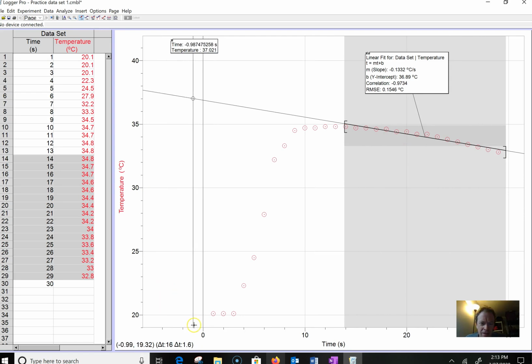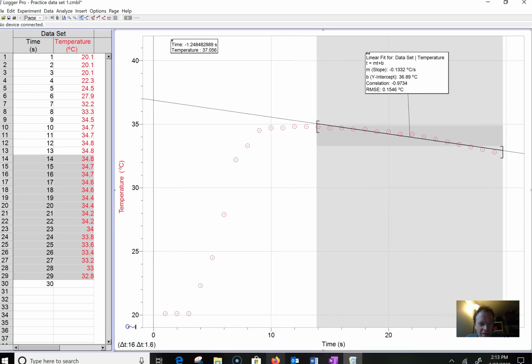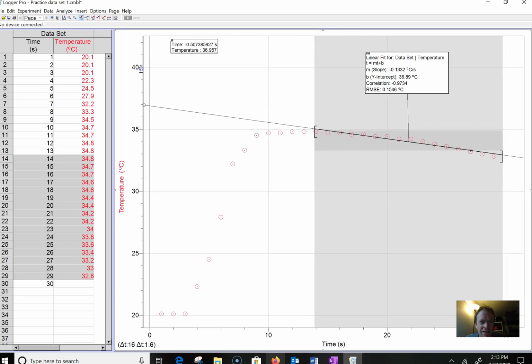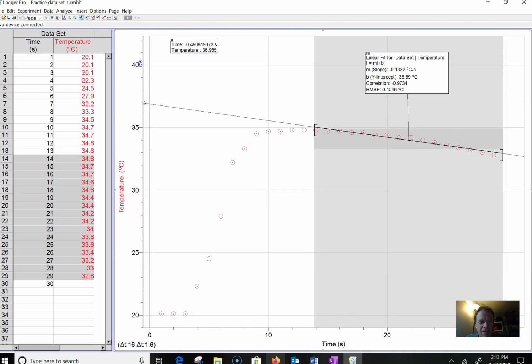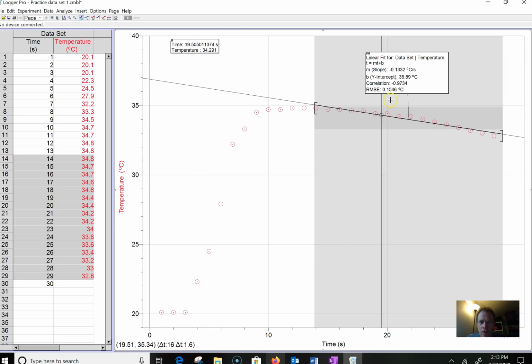And by the way, another thing that's cool about this program here, things like rescaling axes and all of that are just as easy as this. I can drag these axes up and down if I want to rescale things, see things in more or less detail. There's time 0 right here. Time is on the x-axis. So I can go backwards and forwards in time along this axis.